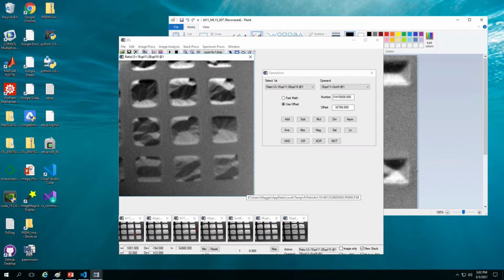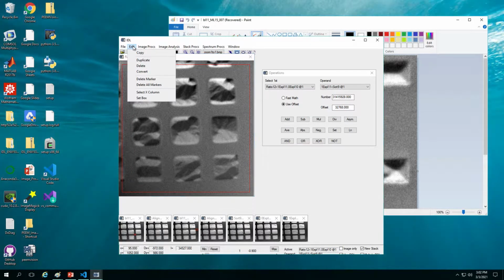One thing to note is that when we are doing the alignment, the image edges might not align perfectly, and that's why we also need to remove the edges. Don't remove aggressively, but also don't be too conservative. We want to have as much data as possible for now, but also don't want to trim the edges too much, so that it would affect the contrast. Now we do this, select the region, okay, click, and we go to edit and duplicate.